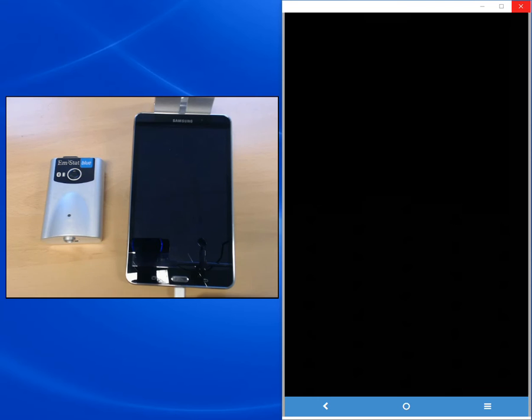Welcome to our PS-Touch introductory video where we will demonstrate how to connect a potentiostat via Bluetooth to an Android device, control it, perform a measurement, set the measurement parameters, save and load methods, and save and share the data that you've created.